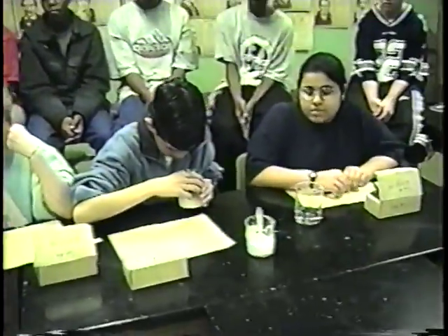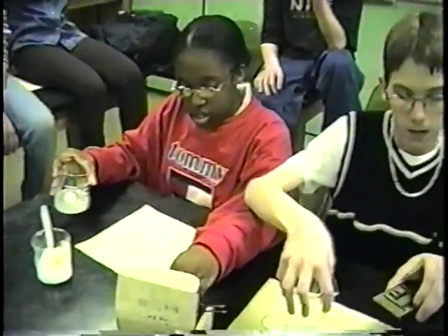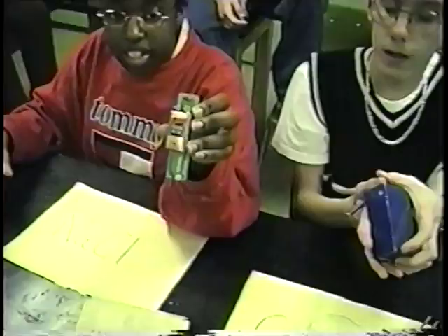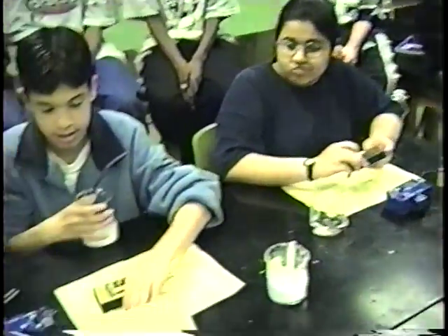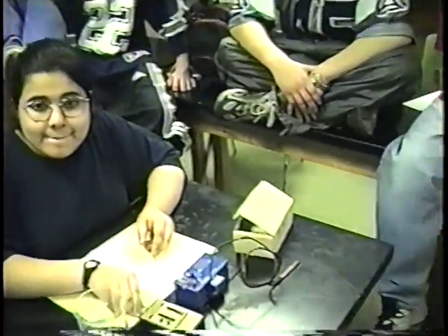Now, all of the people in our lab group today have 2 conductivity testers with them. In fact, we have 4 different kinds of conductivity testers. If you would take the stuff out of the boxes so we can see what you have. Opal, hold up the blue box that you've got there. That's one type of tester. You've got the one with the little blinking light on it. And who's got the one with the buzzer? I do. Hold up your buzzer so we can see it. It's got a little buzzer on top of it. And Shama, hold up the one that has all those little lights on it and numbers that go along with it.